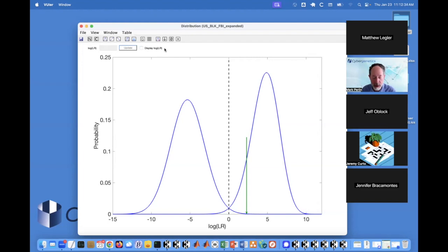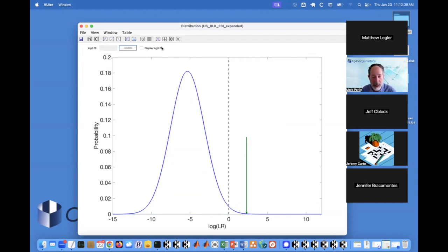So actually, Matt, turn off the contributor distribution. That's the non-contributor distribution. This is the equivalent of if you had compared the evidence genotype that was separated out for this contributor with all trillion possible genotypes, except that there's some math that does this for you with Bayes' theorem that's described in that Helion paper that constructs it exactly so we can work with it. You can see it, we can calculate with it, you'll be able to report from it.